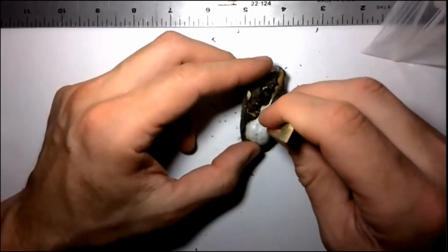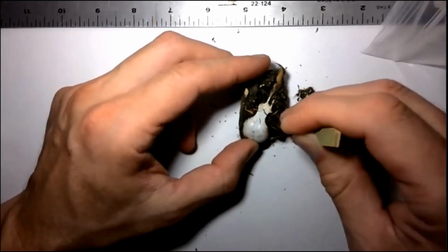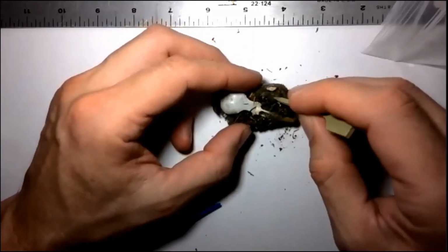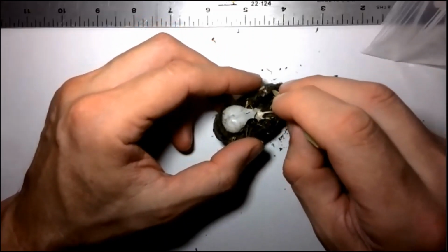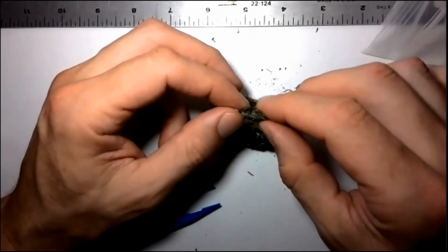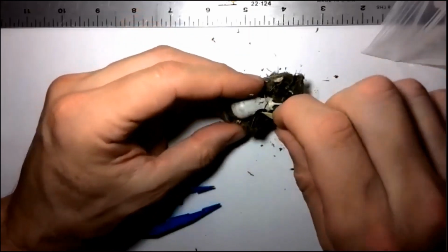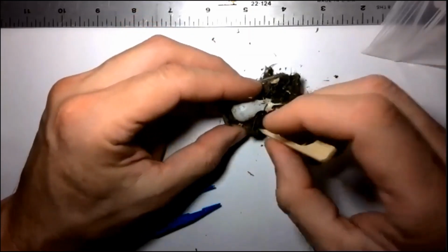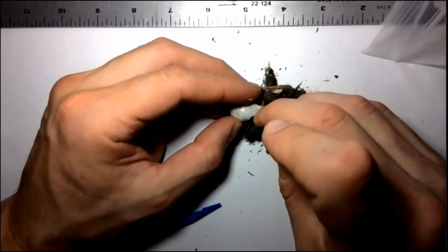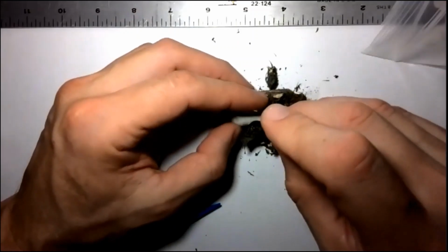So what we're going to do is break the pellets carefully. You have to be gentle. There are a lot of little bones, and if you start doing it very hard, you can break some of these bones. That's not what we want to do. And again, to me, it's always the skull. As I was showing you a few moments ago, there are a lot of elements of the natural history and the ecology of an organism just by looking at their skull. But this one here is an easy one.